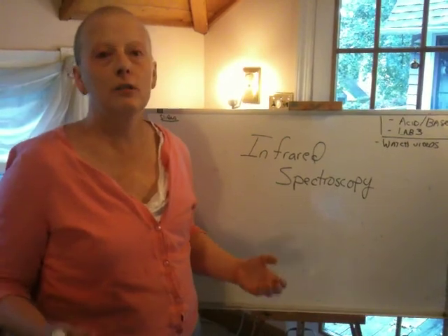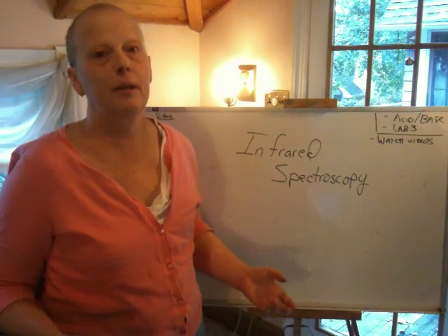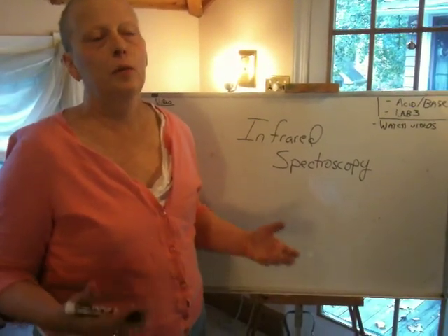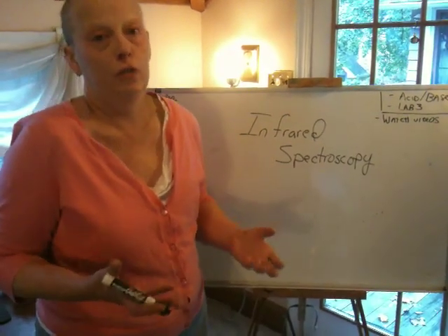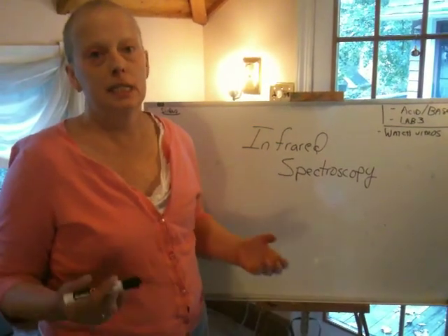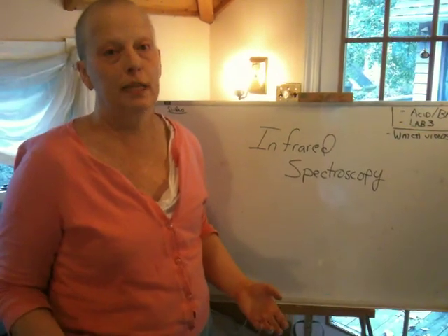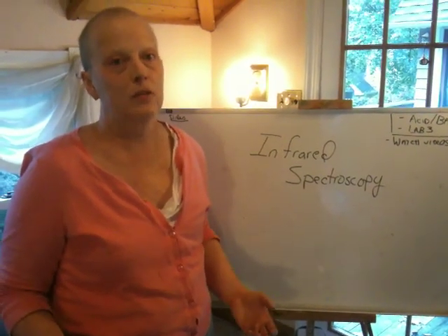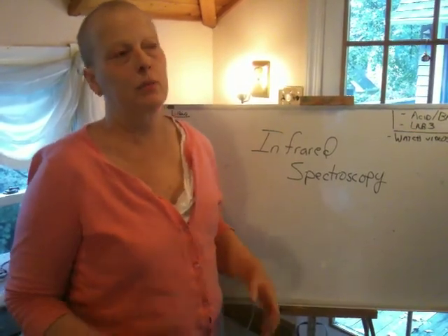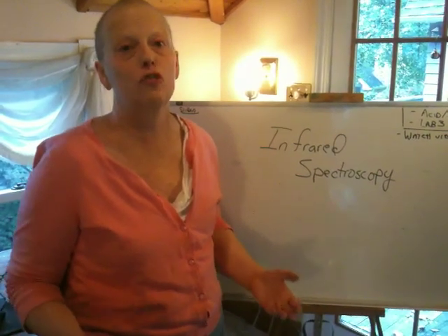Okay? Now, colored compounds are absorbing visible light, but the visible range is continuous with the UV range. Now, what all spectroscopy involves is this same concept, the idea of passing electromagnetic radiation through a sample and seeing which wavelengths are absorbed and the intensity of the absorption. In other words, how much is absorbed. Okay, this is of interest. This tells us something about structure.